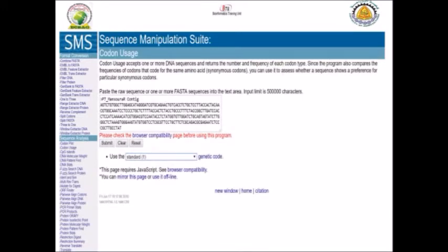You can simply copy and paste your sequence in the submission box. You have to know that this program can accept either raw sequence data or sequence in FASTA format.